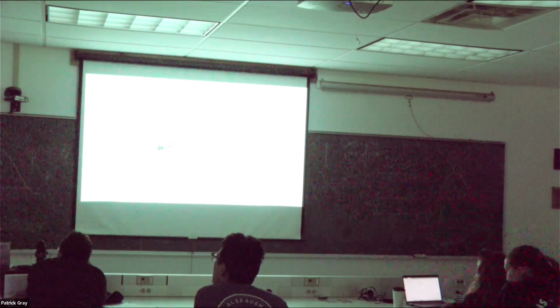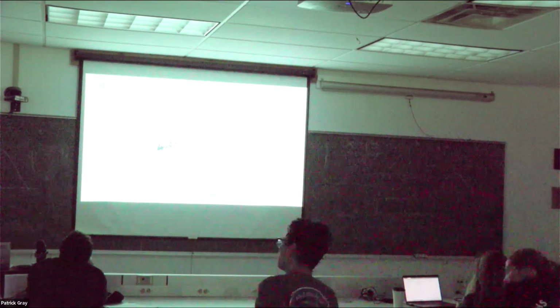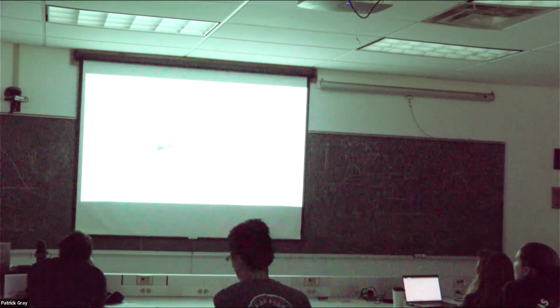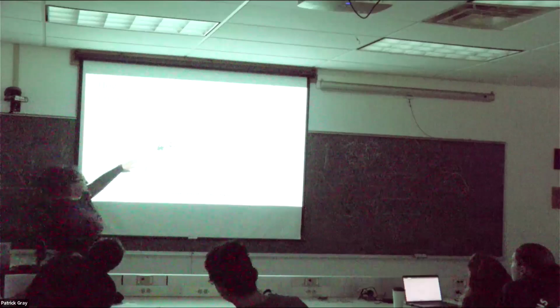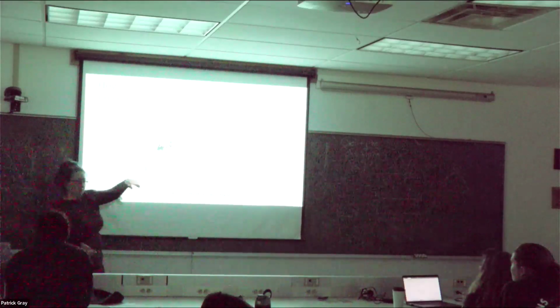And why are we plotting that? Because if both of the things are the same, they're going to be on a straight line, regardless of the concentration that you're encountering. But if you see things going up or down, you can start talking about biases as a function of concentration. So I can see that there are certain trends happening here. There's this thing going up here and this thing going down here.